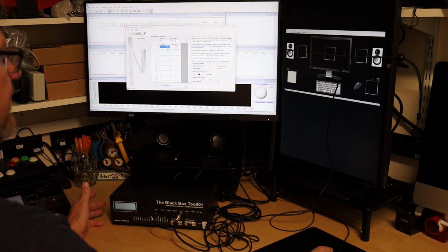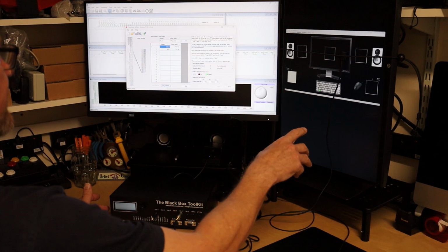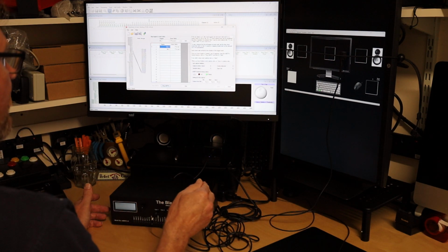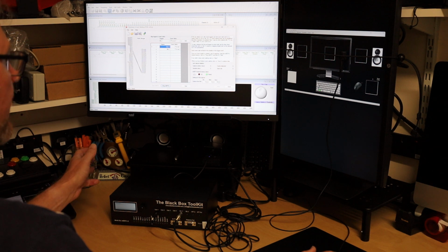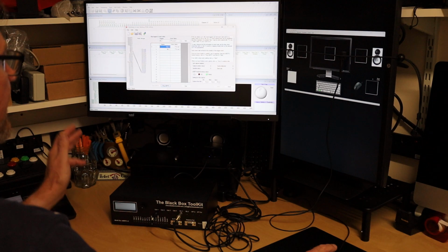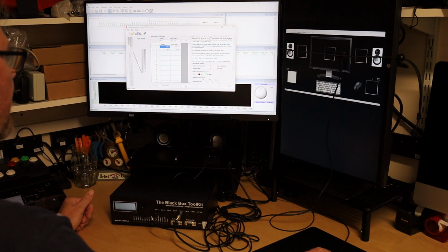So it'll basically say, okay, every time I see an opto, I'm going to event mark that for the duration of the opto, the stimulus image, or every time I detect something on the microphone, I'm going to event mark that for the duration of the audio, and it'll just go away and do that forever. So that's a really neat way of running it off a PC, where you don't need to look at the data or look at the timing data. You just want exact event marks at all times.